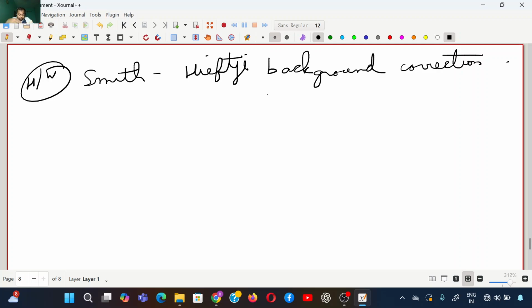Or what happens in case of refractory oxide formation, or interference because of these compounds. Or there can be ionization interference, because at high flame temperature, atoms ionize, and this reduces the neutral atom concentration, giving lower absorbance. So you can also divide it like that.